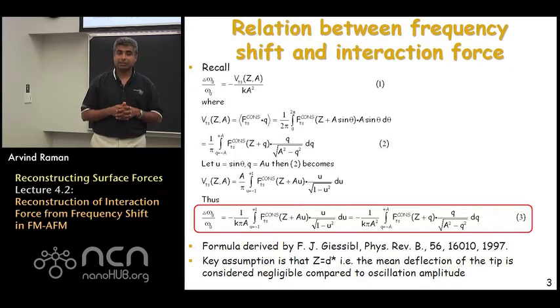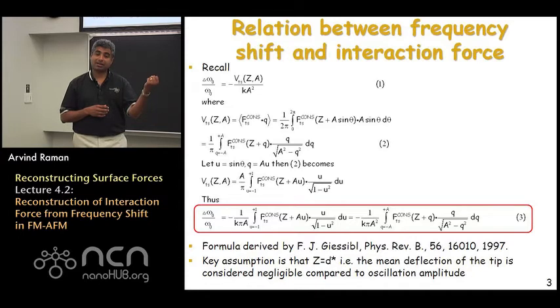So now the challenge is we are measuring the left-hand side, which is the frequency shift as a function of z. What we want to figure out is the kernel of the integral, or the integrand inside, which is the tip-sample interaction force. This is what is called an inversion process. We have to invert the observables to get the kernel of the integral.